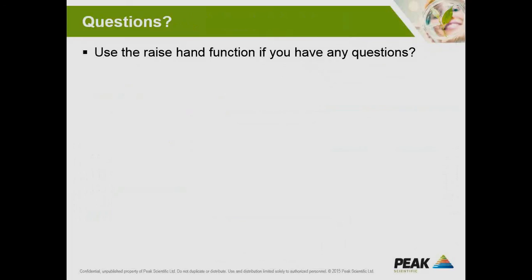The next question is from Mr. Narasimha again, asking what is the maximum distance between the generator and the GC for it to work effectively? Right. Well, we'd normally recommend that the generator is located close to the GC application, or the stack is located close to the application. We'd normally recommend within 10 meters, but ideally within 10 feet.